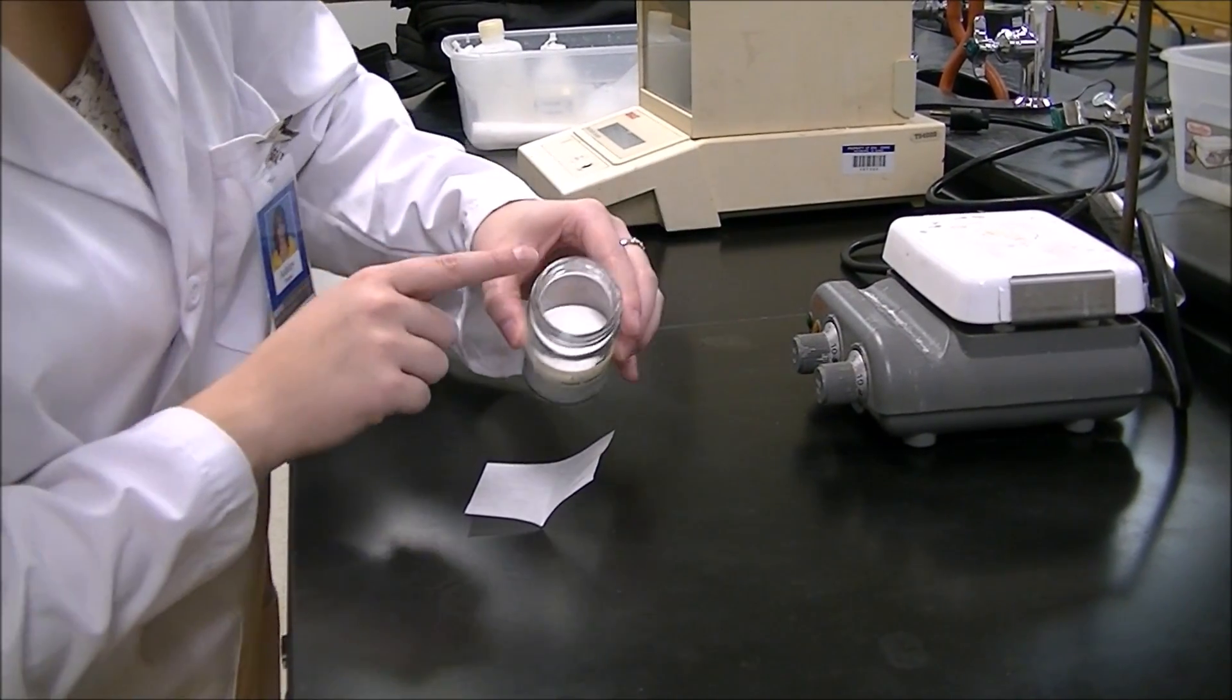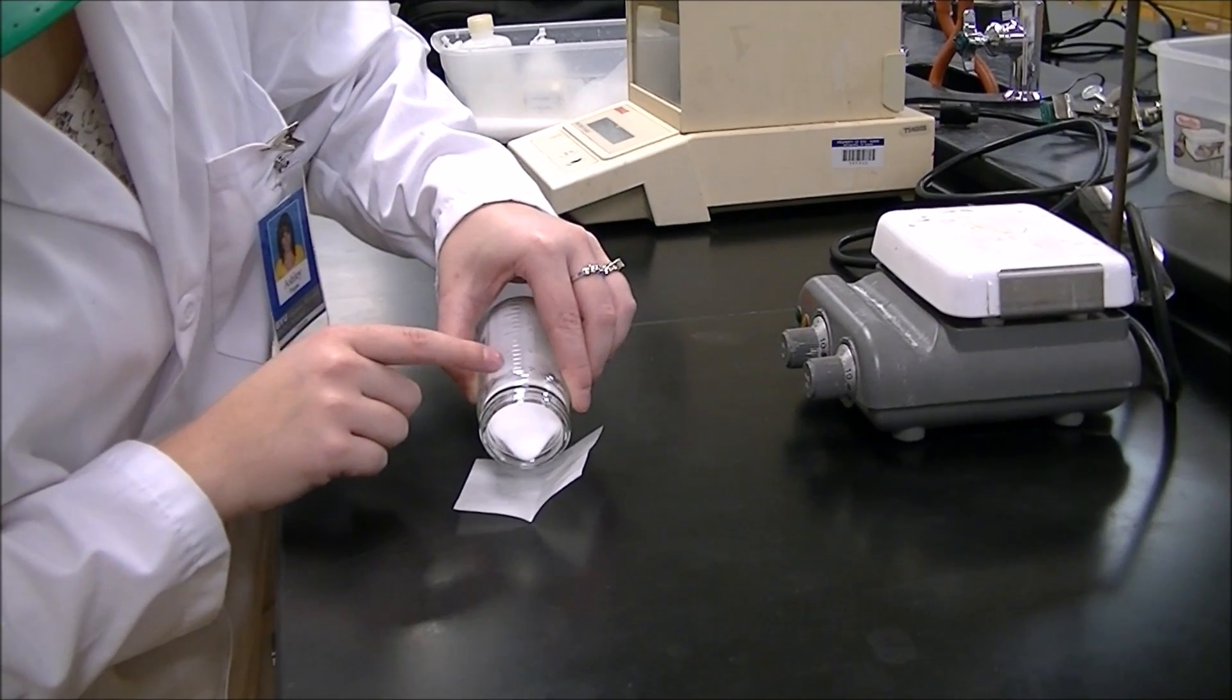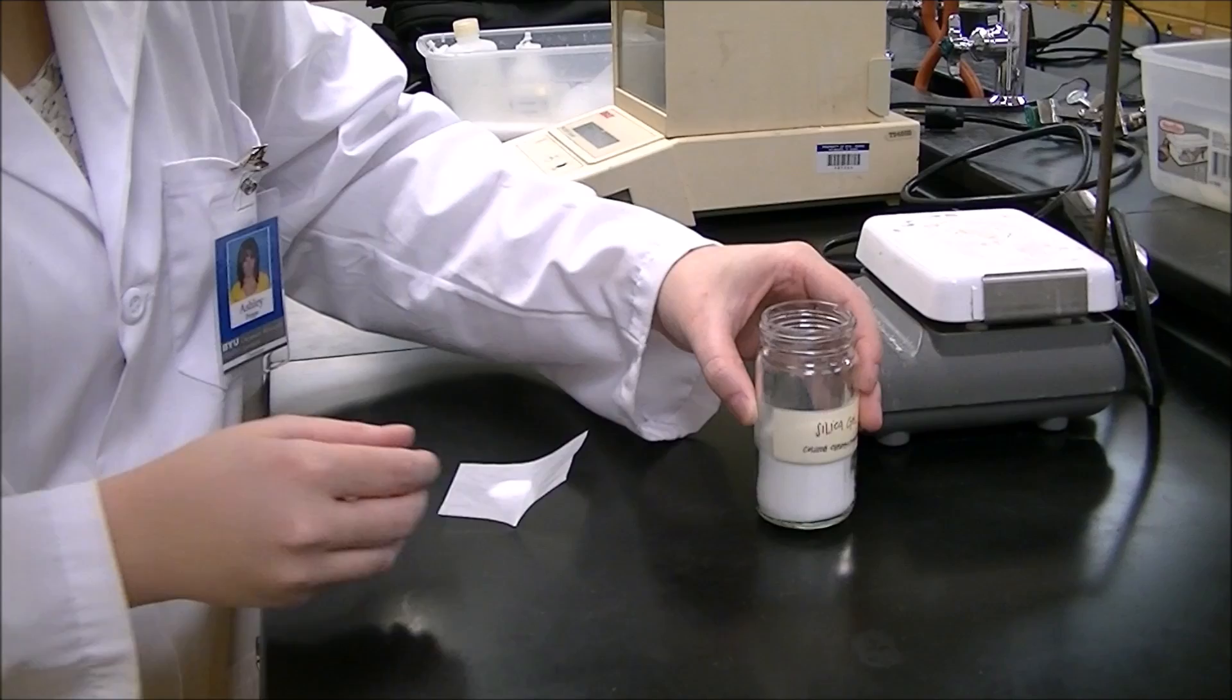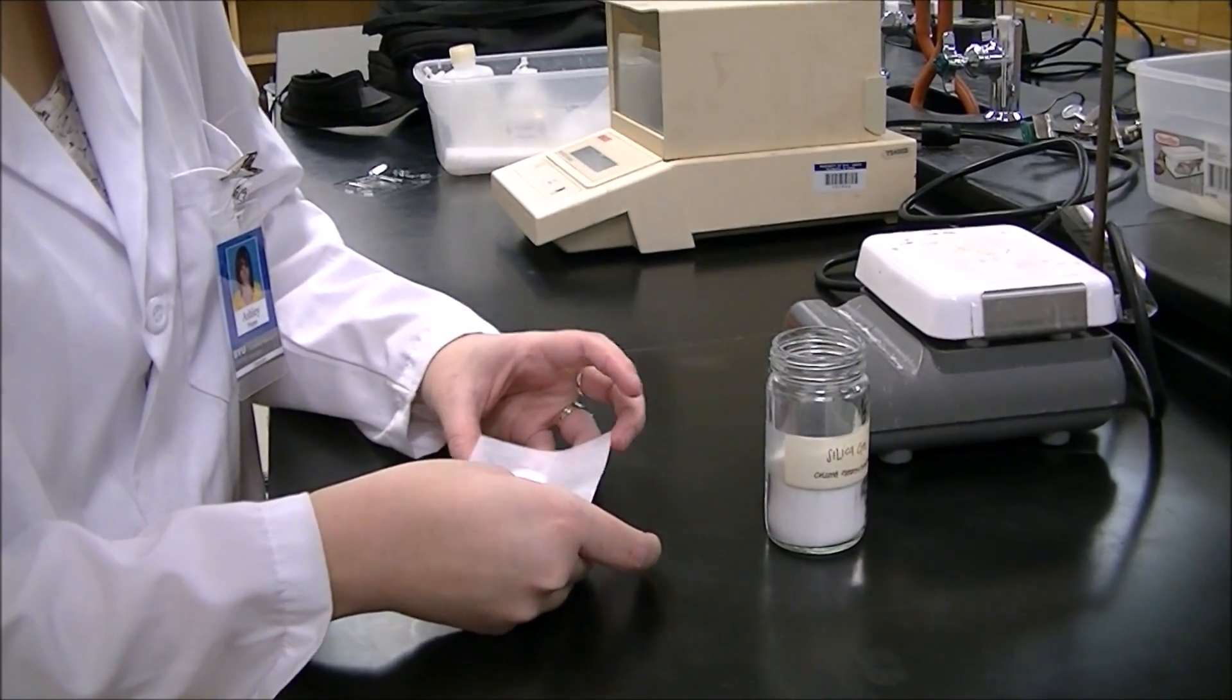Fill your column two thirds of the way up with silica gel. You want to leave about an inch worth of space left at the top. And be careful not to spill or inhale any of the silica.